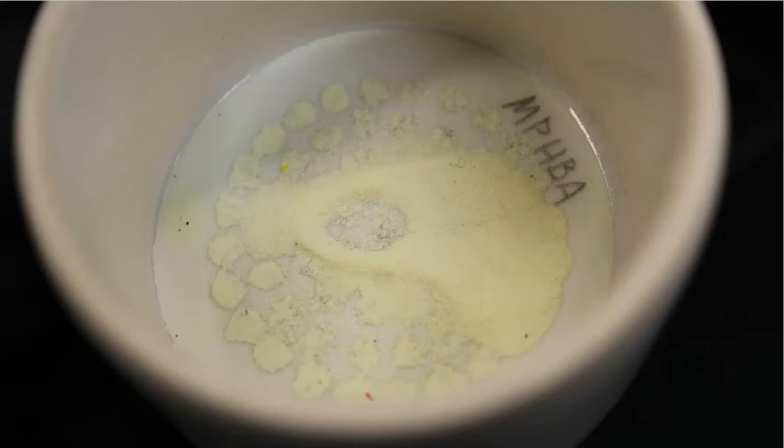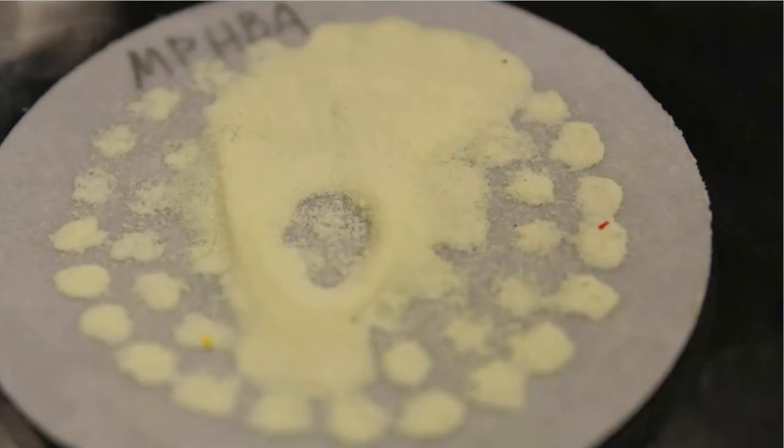So this yield is probably not very good. Is it something that I did, or was it something that the reaction did? Oh, that's for you to tell me. We'll figure it out. So here's just another view of the methyl para blah, blah, blah, so that way you can take a better look at what that product looks like.